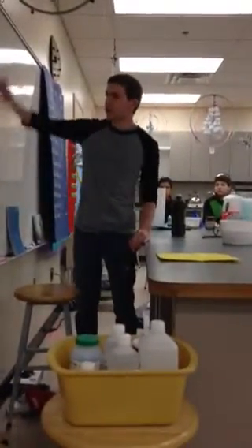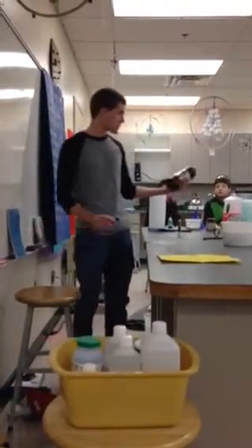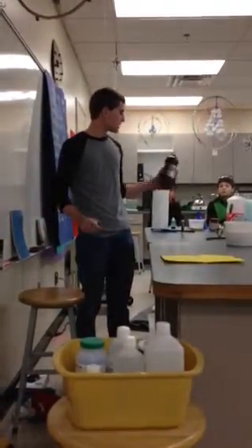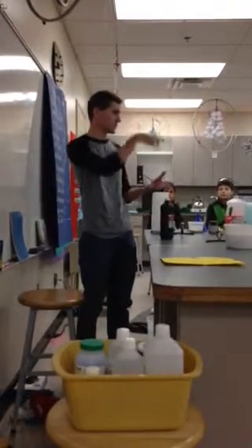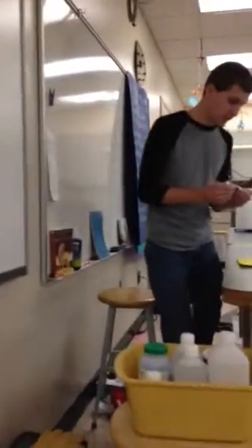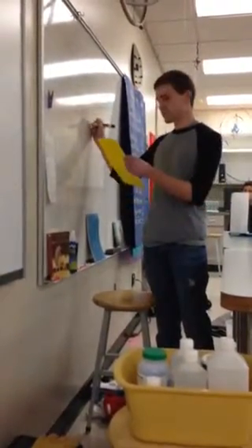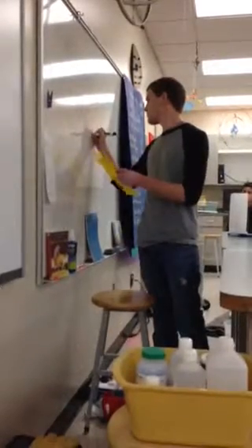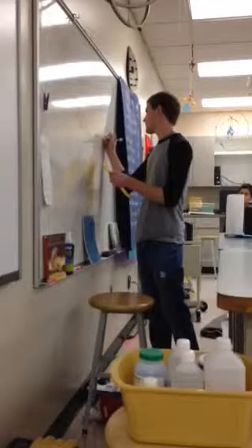They actually have special bottles that they make for higher concentrations of hydrogen peroxide, which we were going to use on this, but we didn't get it in time. And the bottles actually expand. They have little folds in them, so they'll grow upward while the hydrogen peroxide breaks down. Let's see. Hydrogen peroxide is... this is the reaction that's occurring.